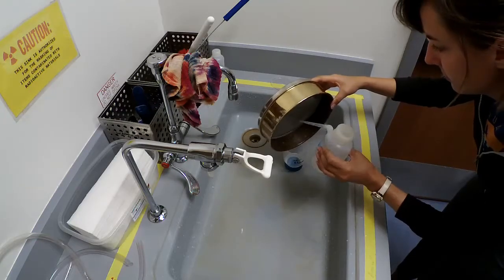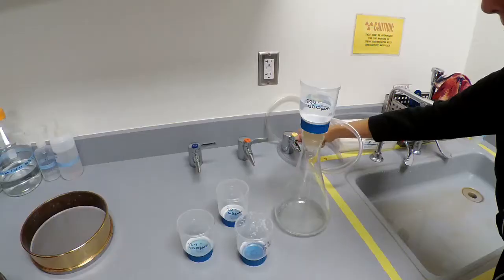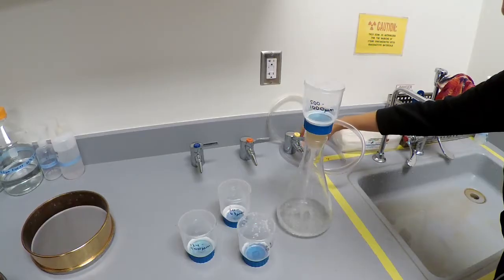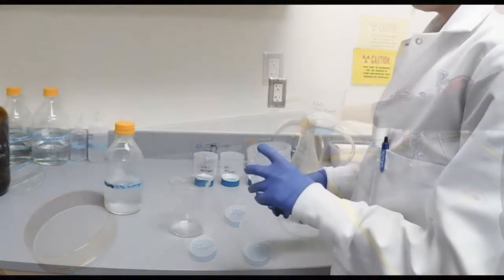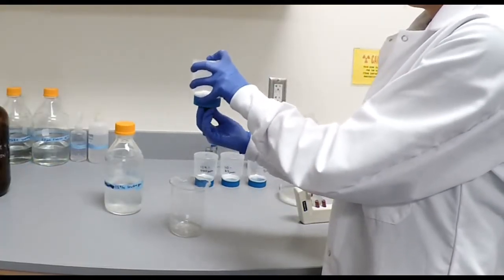Then backwash each sieve into the corresponding filtering unit with Nanopure water. Vacuum filter off any remaining water. Place a rubber stopper into the bottom of the filtering unit and place it into a secondary container.